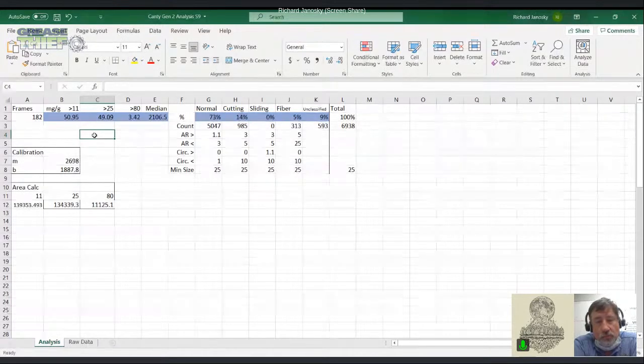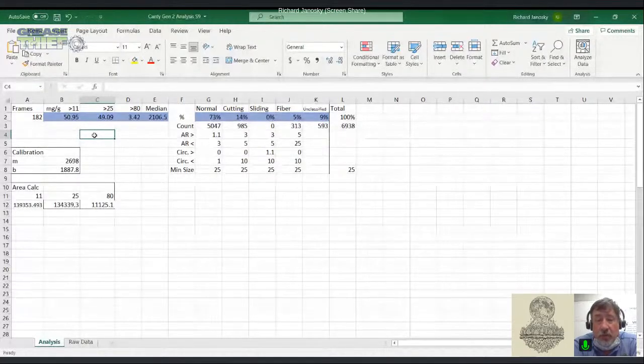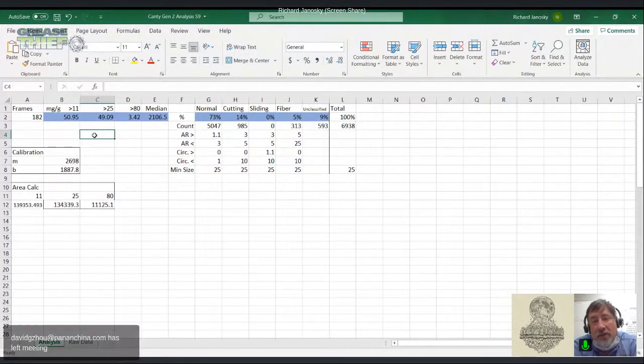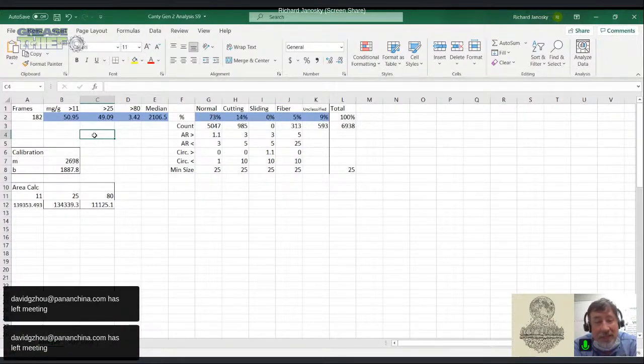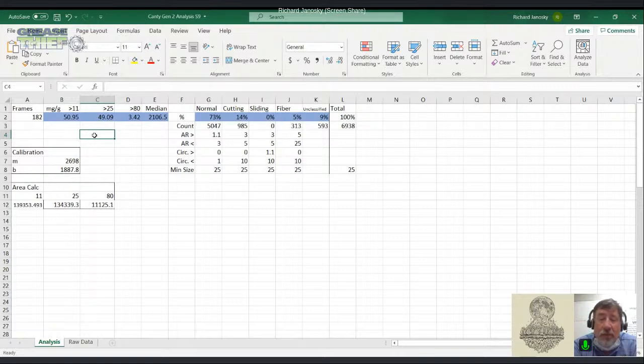And if we know that we're having too many particles and too high of a concentration, we can make a recommendation to our customer to work on that. Yeah, and more particles could spell bigger problems, but also consider the appearance of a non-typical population. If you saw this response in a place where you had very few cutting wear particles in your routine sampling, even a modest increase in the number of particles would send up a flag, because now you've introduced a new wear mode.